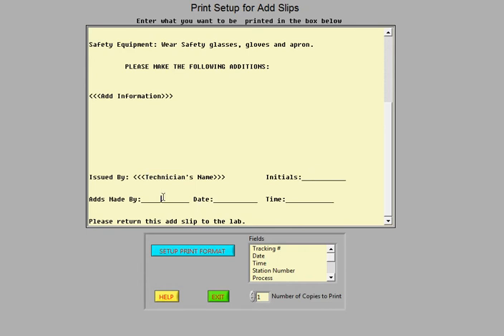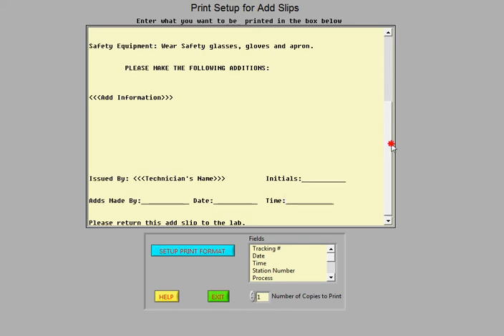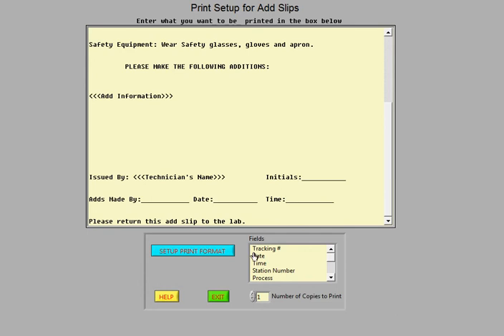And here's the date and time. And it says to please return this slip to the lab. So you have lots of options and flexibility here on how you set up your add slips. And it's great because each situation may be a little bit different. So that's how that works.